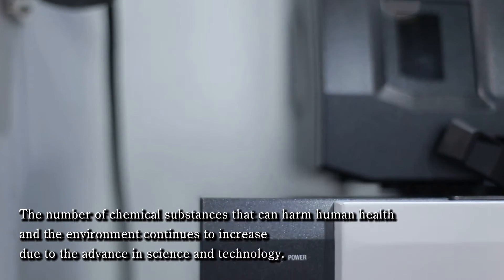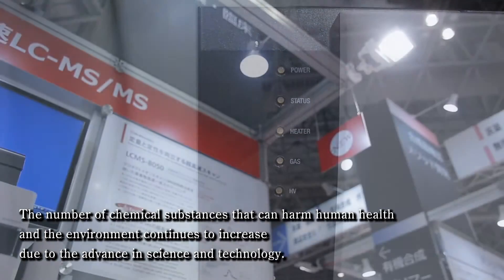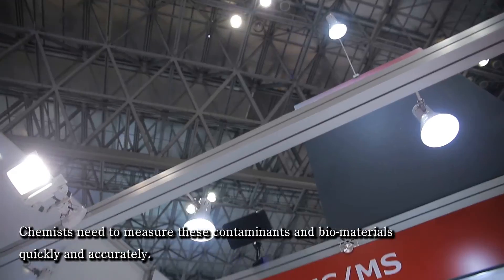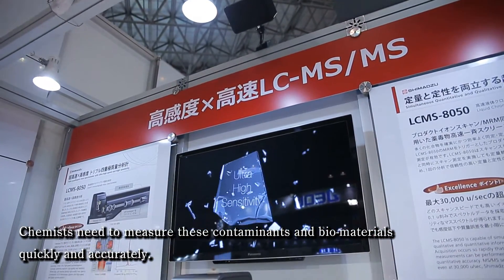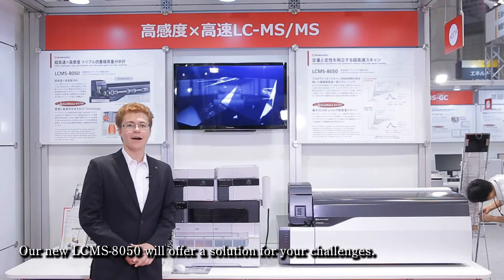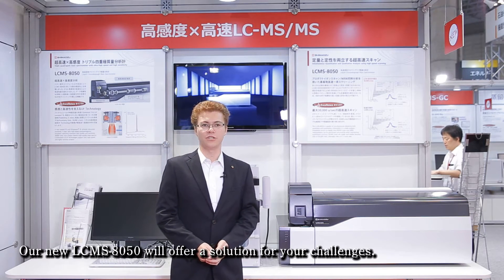The number of chemical substances that can harm human health and the environment continues to increase due to the advance in science and technology. Chemists need to measure these contaminants and biomaterials quickly and accurately. Our new LC-MS 8050 will offer a solution for your challenges.